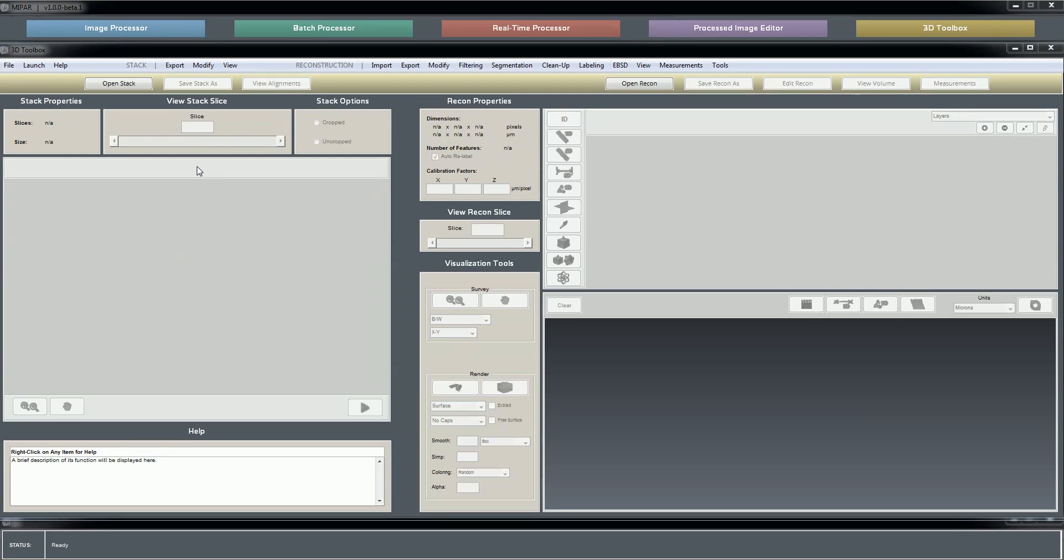Right now, MIPAR does not support the reconstruction of a volume from a tilt series. We use other software to do the reconstruction and then load in the reconstructed volume into MIPAR for the processing and quantification.